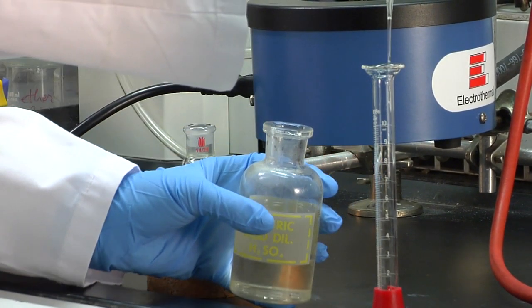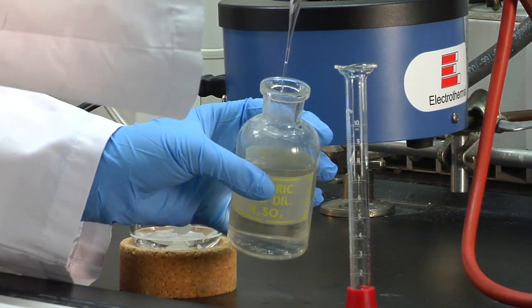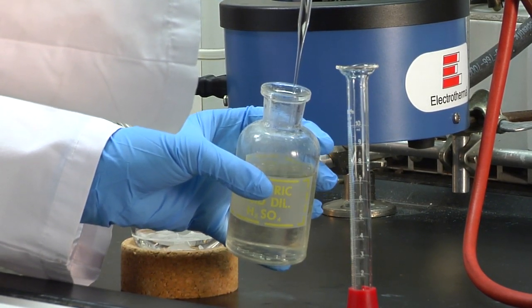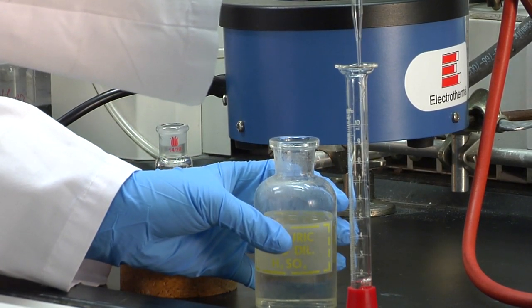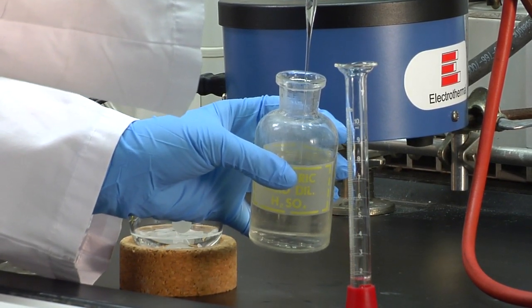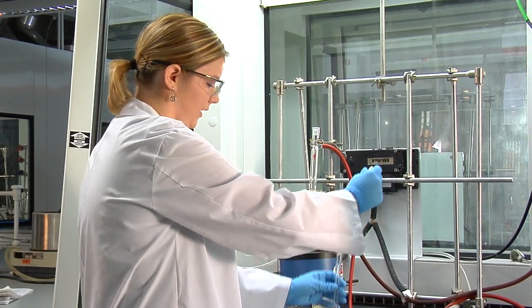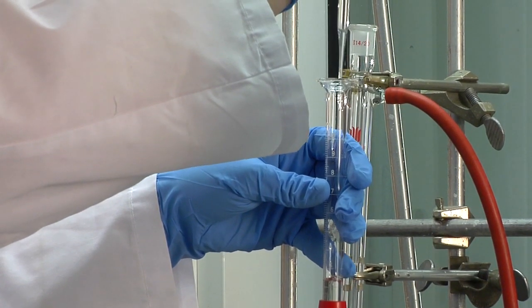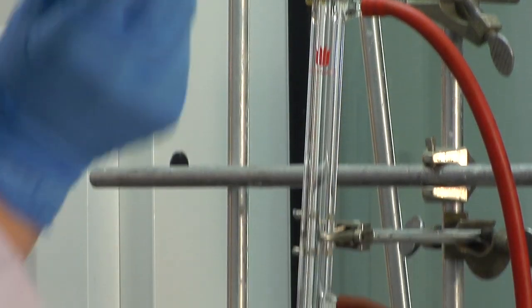So this is going to be about 3 different squeezes of the pipette bulb. Sometimes you'll need a little bit more because sulfuric acid is very thick. Then on this last one here, I'm just going to bring the graduated cylinder up a little bit just so I can see if I'm approaching the 3 mil line or not. I'm just going to add a little bit more.